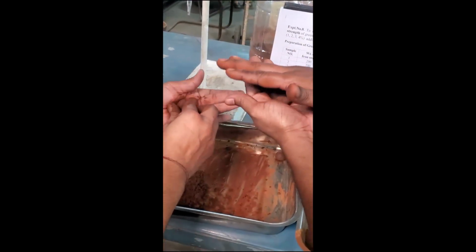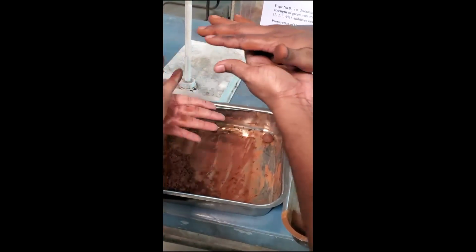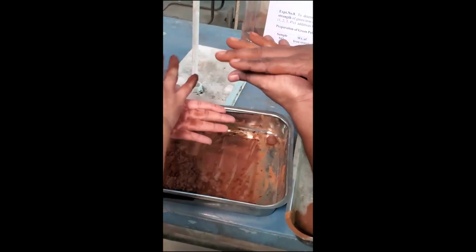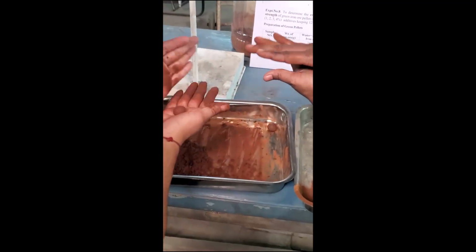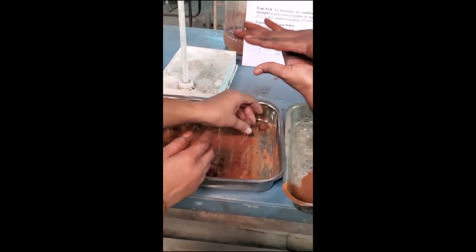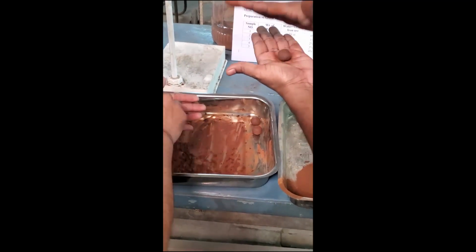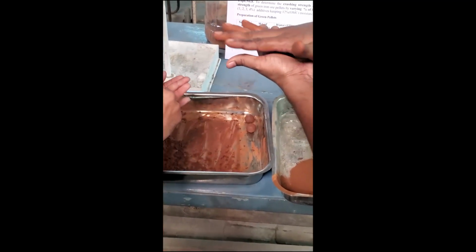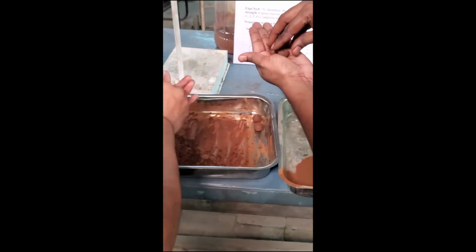Now we are making the pellets with iron ore without bentonite, 0% bentonite. This is the way of making the pellet. As soon as we make the pellets, we have to test immediately, otherwise water will evaporate. So in the green condition, we can't get the results.